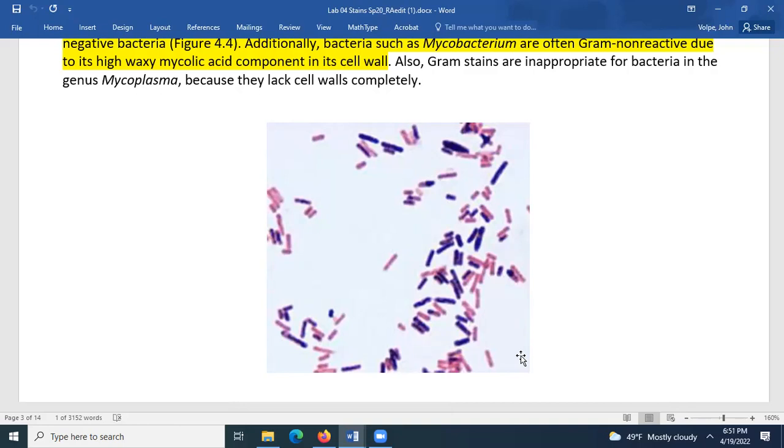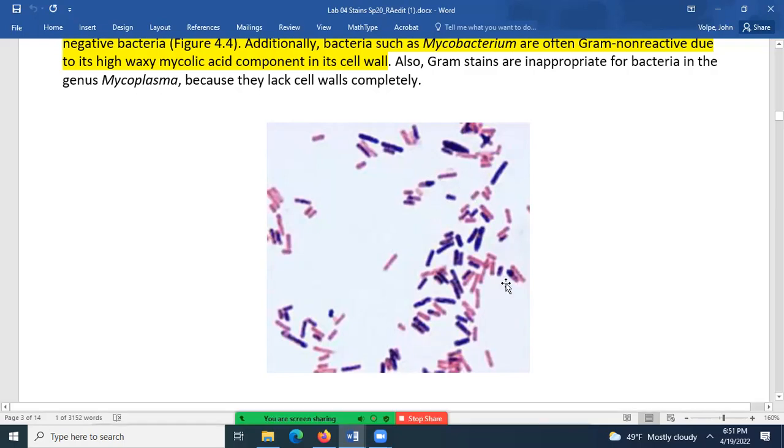For the gram stain, you need to use freshly grown cells or the stain may not work correctly. And when they were using 2-week-old cells, they were seeing this. And the reason they were seeing this is because some of the cells were too old and they were dying.